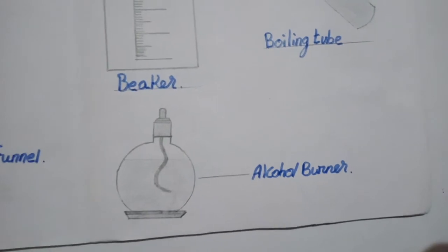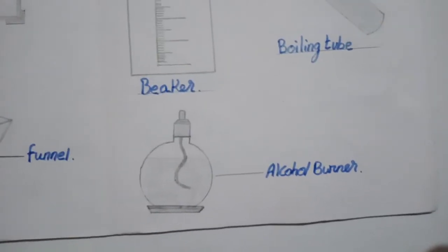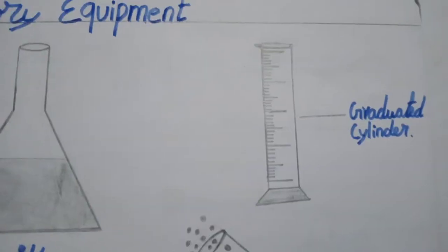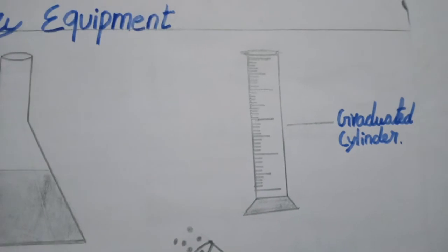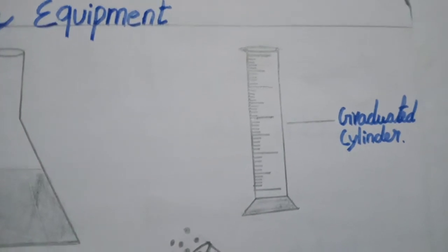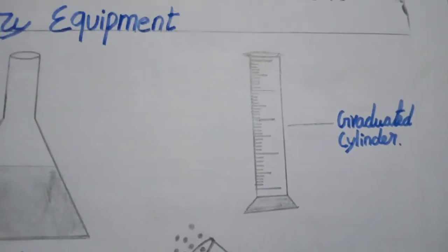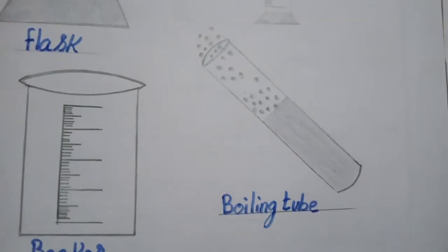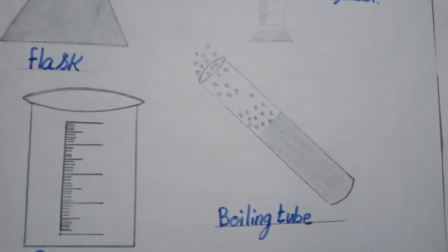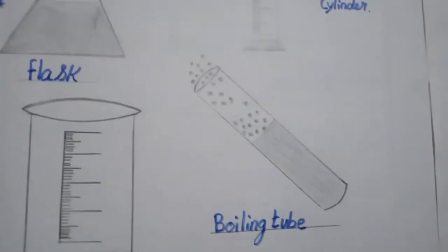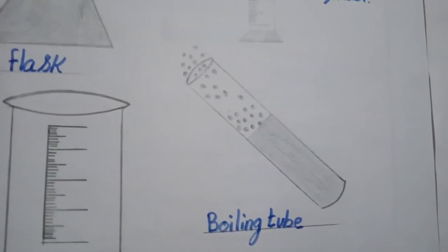This alcohol burner is used to heat the test tube, beaker, or flask. Next one is a cylinder. This cylinder is used to measure chemicals. Next one is a boiling tube — this tube is like a small test tube, and this is a big boiling test tube.